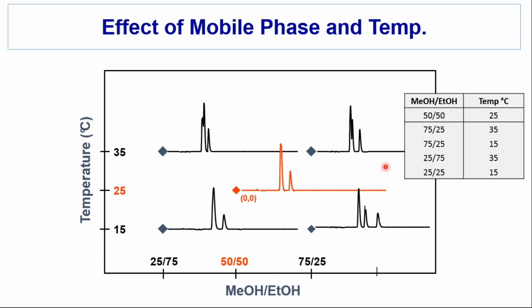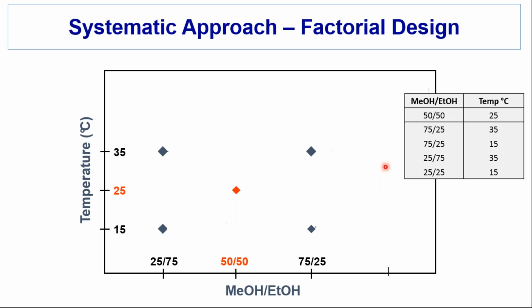Well, I thought maybe I can go to some extremes, either higher temperature or straight alcohol. That didn't work out. But what I did learn is the separation wasn't going to work, and there wasn't any sense continuing to beat my head against the wall, so I went to a separation on another column.